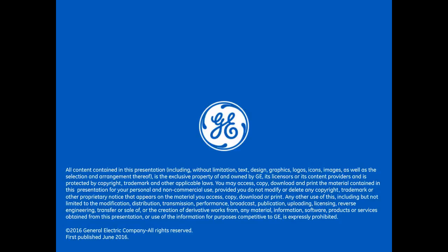Thank you. Let's see. The next question is, how many screens can I complete with one CRISPR RNA library? Good question. It is also going to be dependent on how much you order, right? So how much per well. There is a calculator on our website in the Tools and Calculators section that can help you determine this. But I'll give you one method as a rule of thumb.